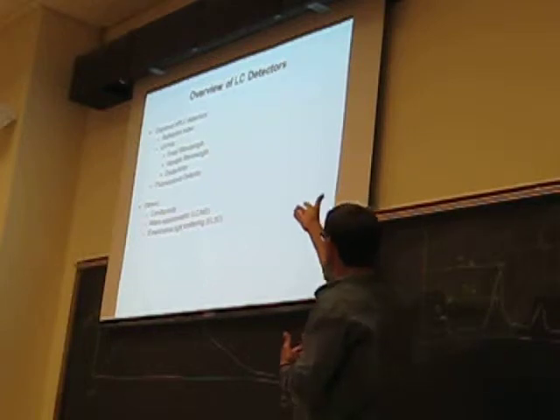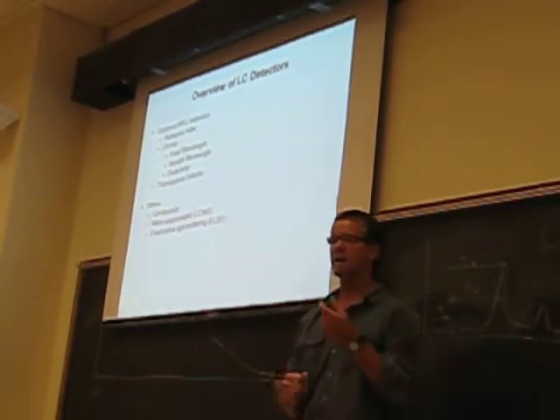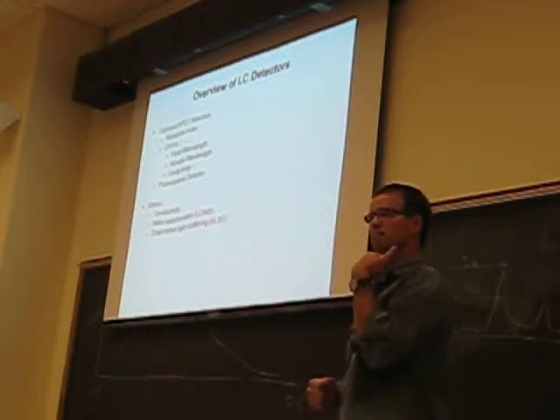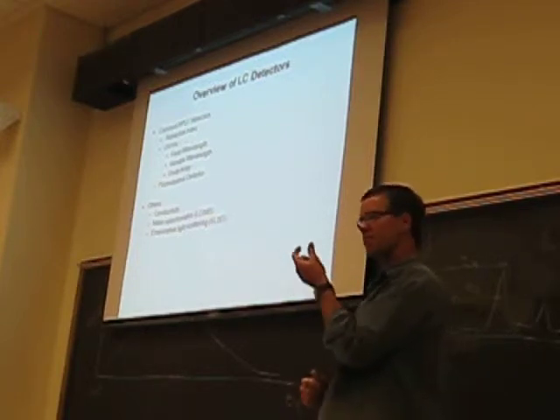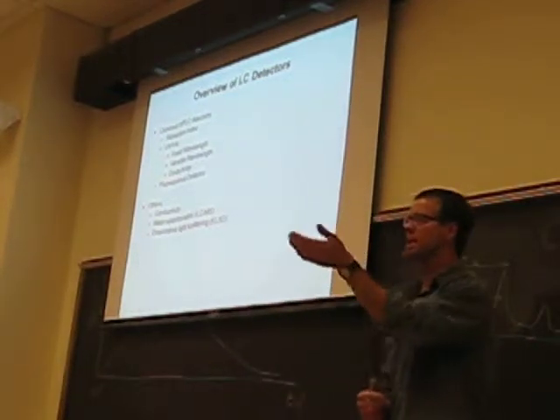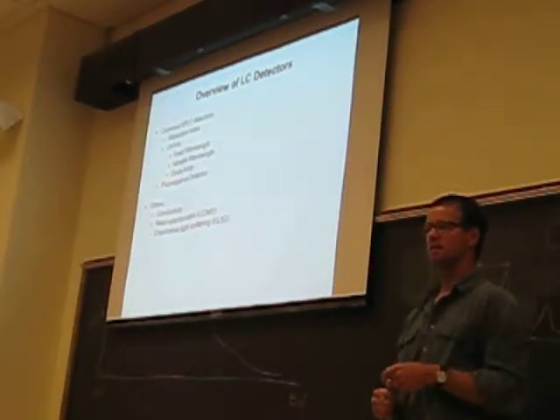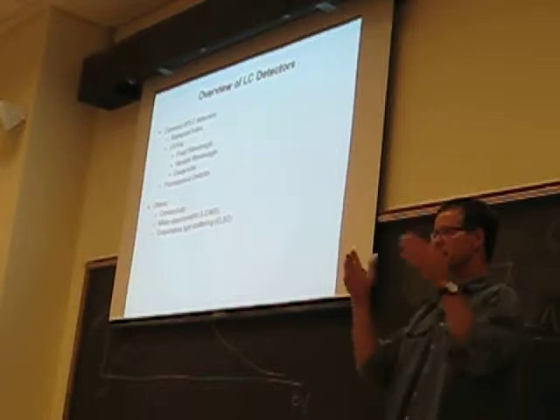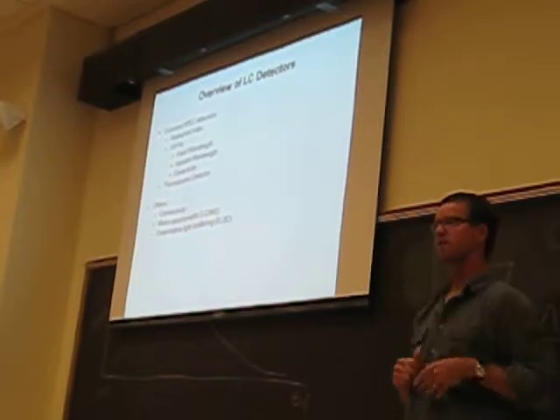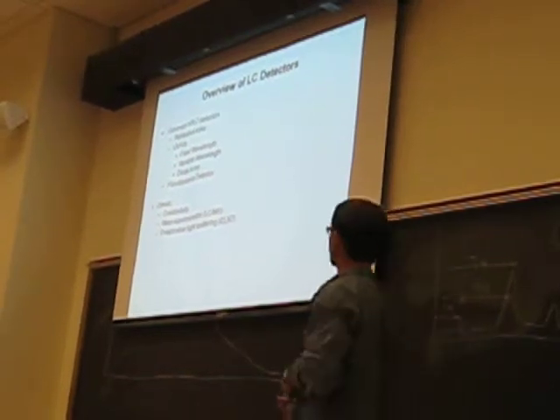Well, the same concept is used in liquid chromatography, where they can have these variable wavelength detectors. For a variable wavelength detector to work in liquid chromatography, it has to be just like it was in your UV spec. There has to be a source of broadband light, and there has to be a way to select certain wavelengths from that, and it works very similarly.